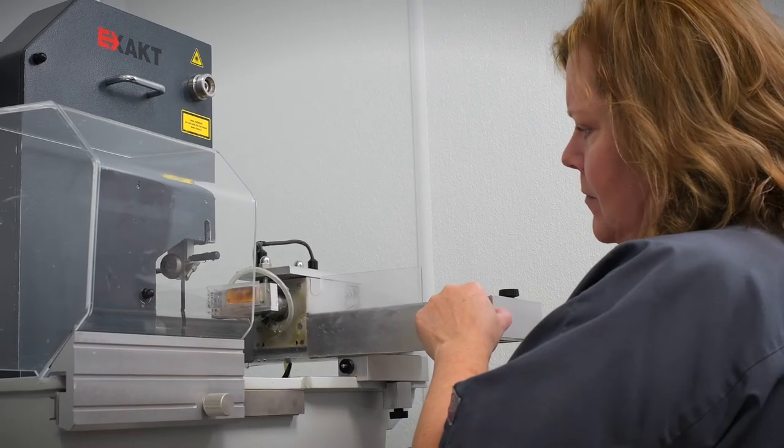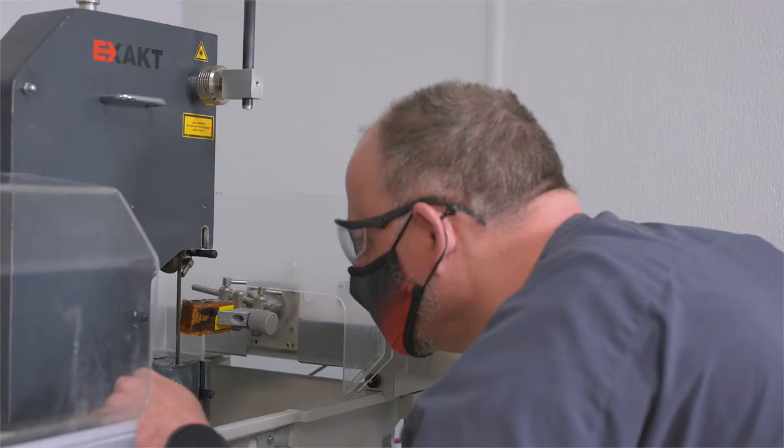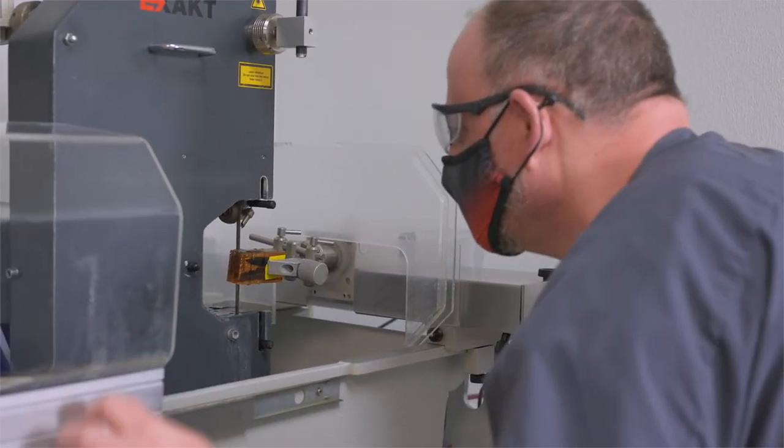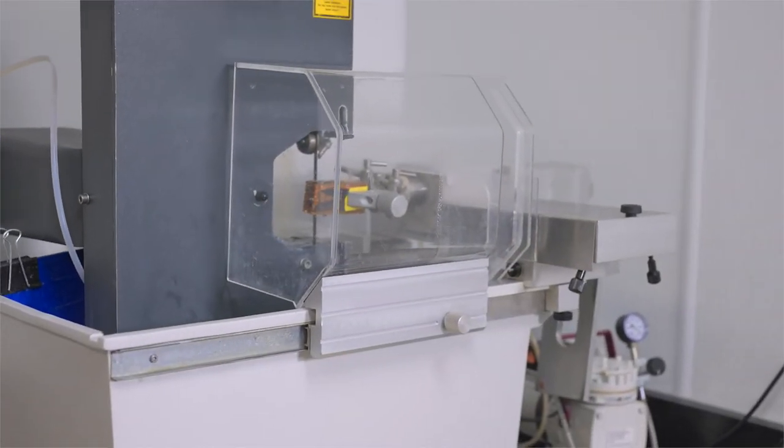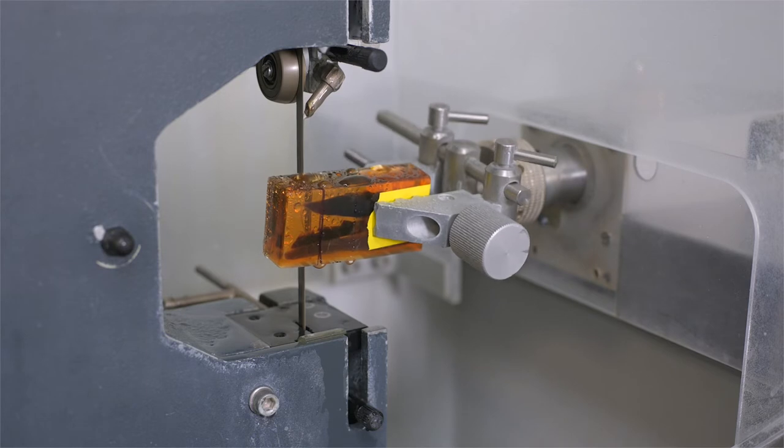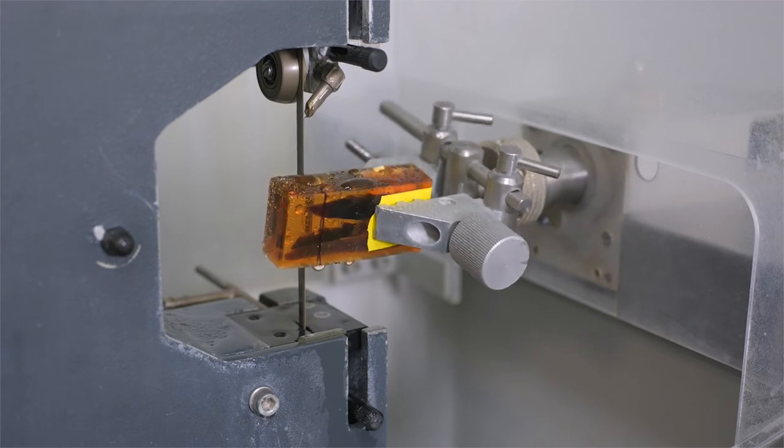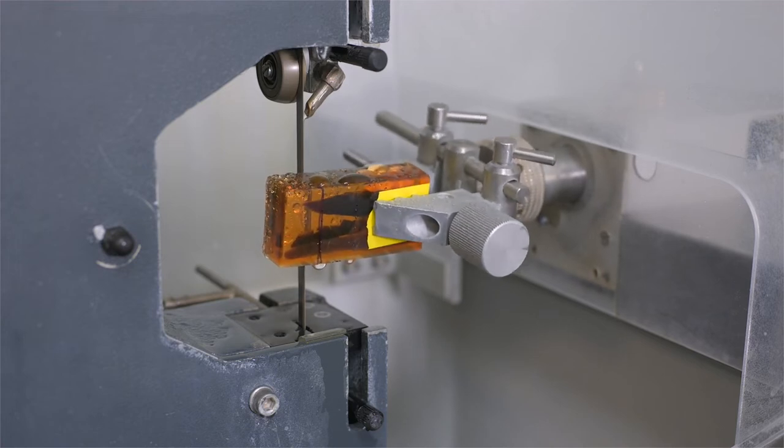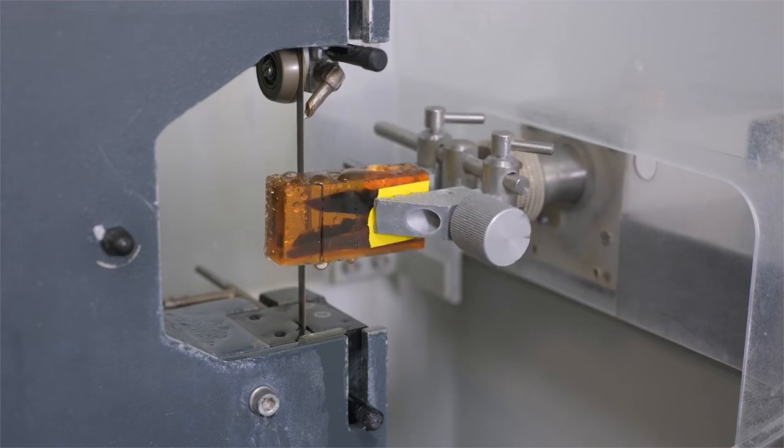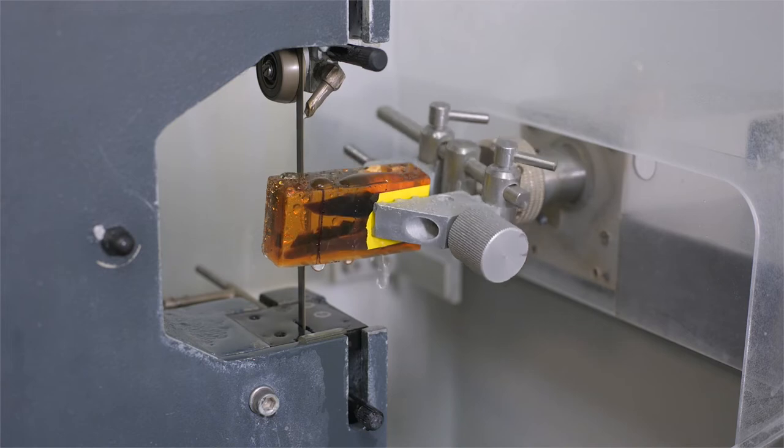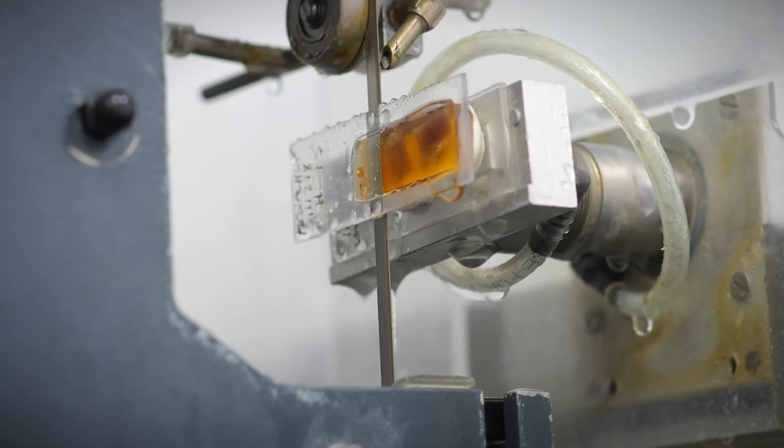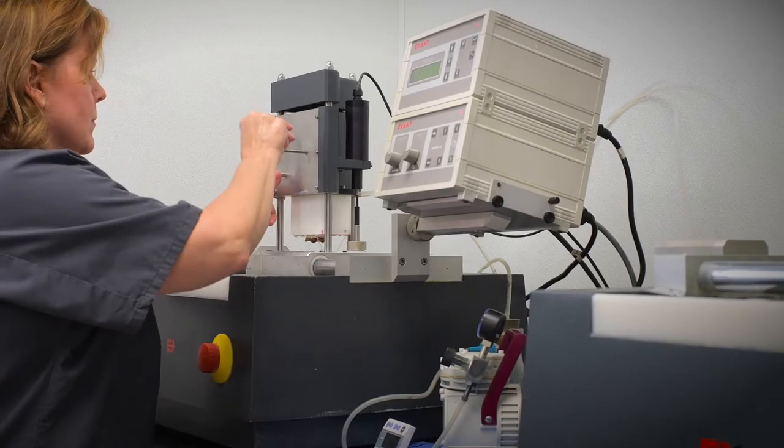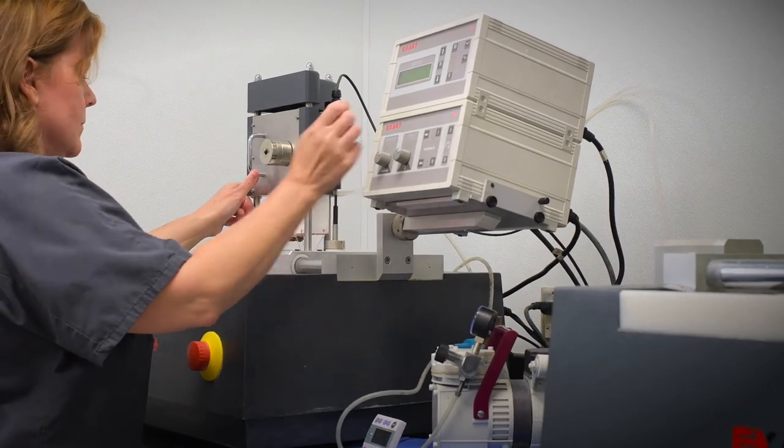The exact grinding system is used for devices whose material composition does not allow for thin sectioning on a microtome. Examples are devices containing hard alloys such as cobalt chromium, nitinol, or multiple components made of varying materials. Large embedded samples are now made into blocks using an exact band saw with a diamond blade. An x-ray cabinet can be used to assist with determining cut lines. Weights and oscillation assist with cutting through the block.